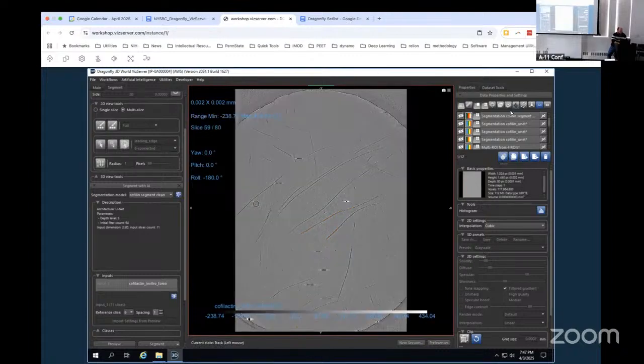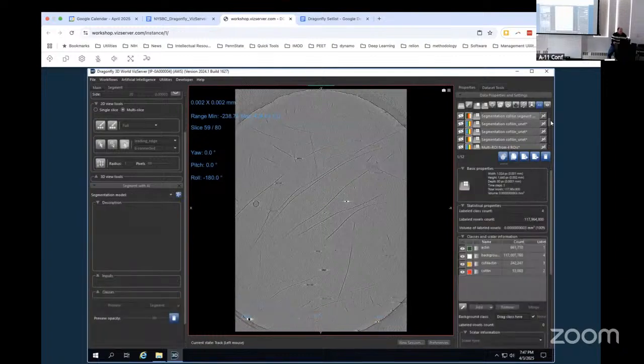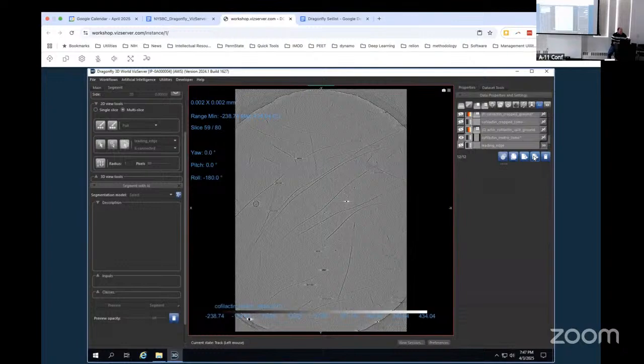All right. So that's using synthetic data alone, train a network to segment in vitro data. It works really well for this kind of stuff, typically. If you have some relatively pure thing in ice and you need to quantify something about them, it's not that hard.